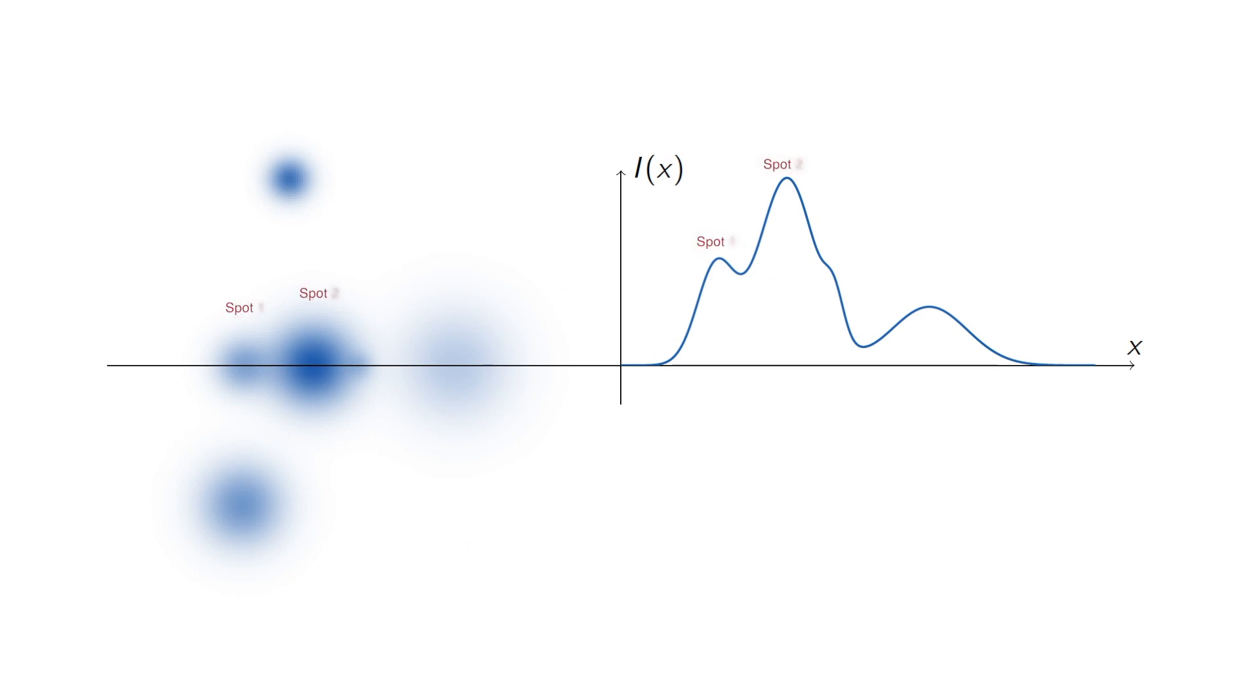In order to understand why the problem of counting these spots is difficult using an automated method, let's consider an example of a commonly used spot counting method. In this case, the curve shows a cross-section of the luminosity of the spots going through these four spots in the center. You'll have spot one and two which give distinct peaks, spot four which is dimmer will also give a distinct peak, but spot three will be partially occluded by the second spot. A very common way to count spots is to simply threshold the image. We apply a thresholding level and everything above this level is counted as a spot.